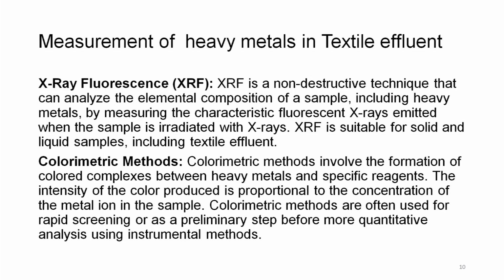So, this is a new technique, and here the characteristic fluorescent X-ray will emit certain rays and those rays are then detected.